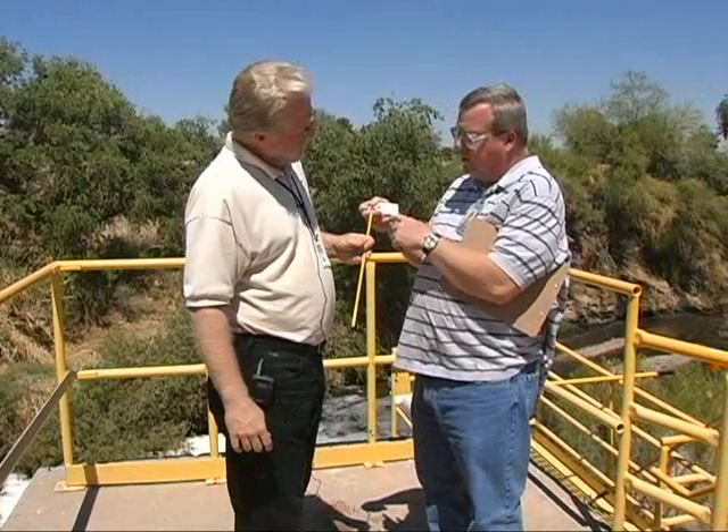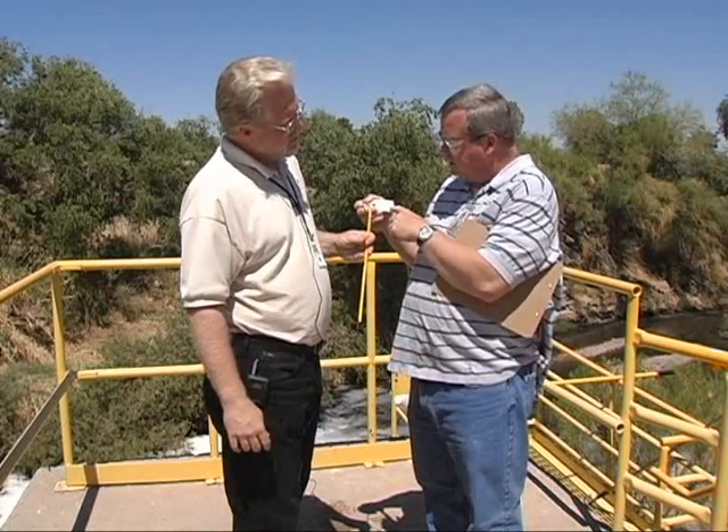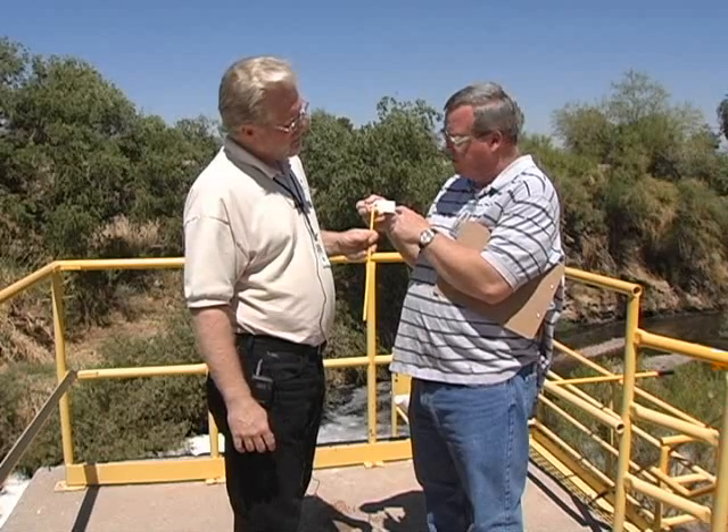Ed's going to show us how they do their sampling. What's this little tag on the thermometer? This tag is our correction factor. Thermometers are calibrated by our quality control department and it has a correction factor of negative 0.3. So when we read the thermometer we have to subtract 0.3 degrees from it, and that would be the temperature we would record.